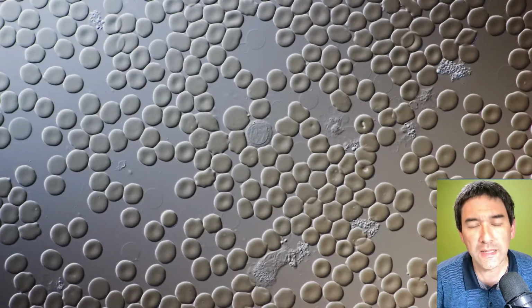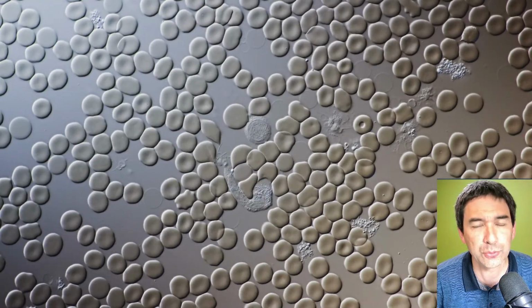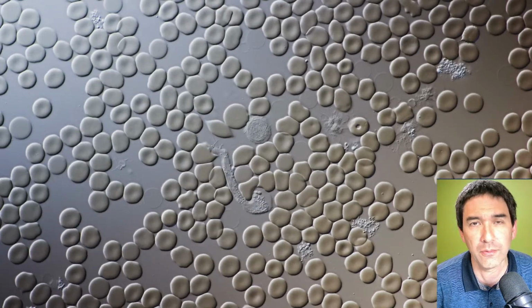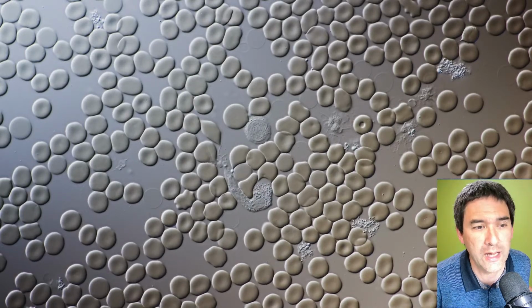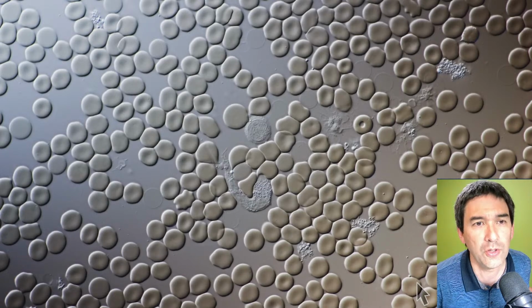I did not add an anticoagulant. Adding certain substances probably would or might impair the movement of the cells somehow. And the reason why it did not stack up or coagulate is actually quite simple.